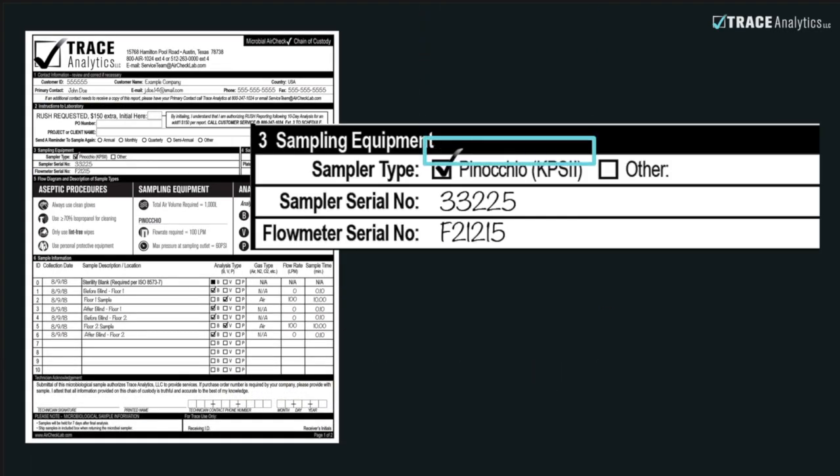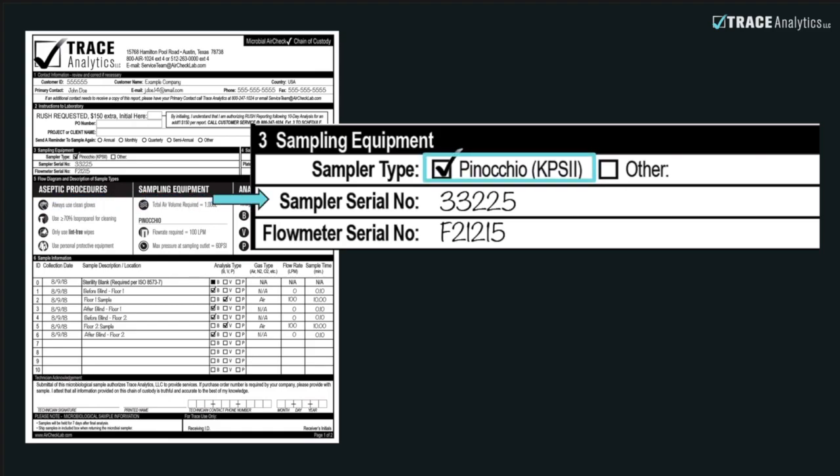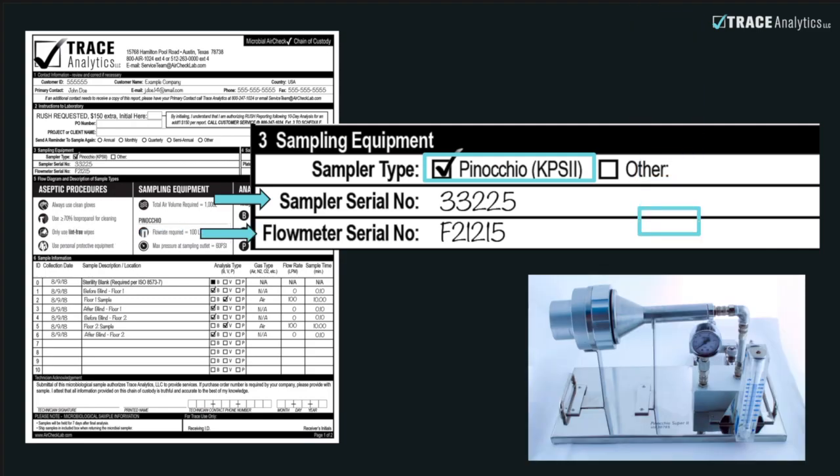In Section 3, you'll need to enter the sampler type. In this case, it's the Pinocchio. Write down the sampler serial number and the flow meter serial number. These can be found on the base of each tool.